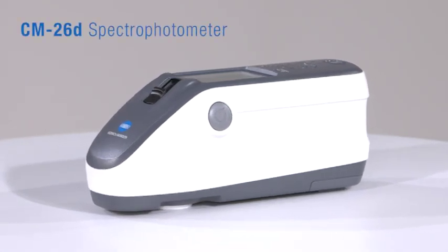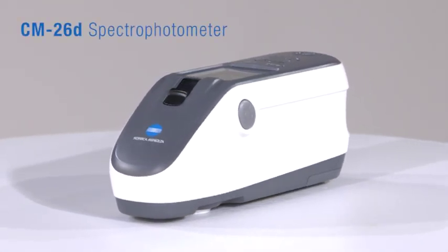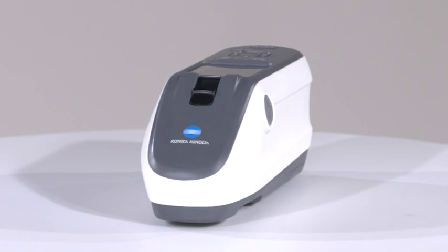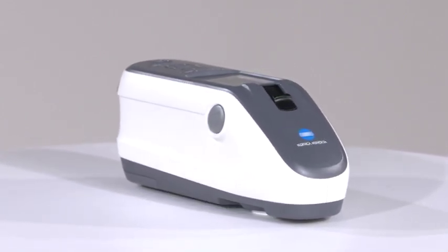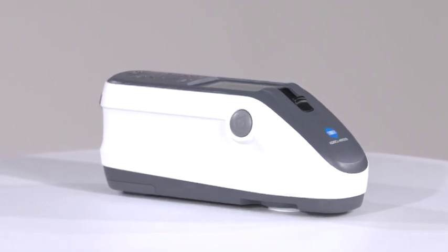Konica Minolta's all-new CM26D is the next generation of portable sphere spectrophotometer, with its unprecedented accuracy and inter-instrument agreement which was previously reserved for laboratory-grade instrumentation.